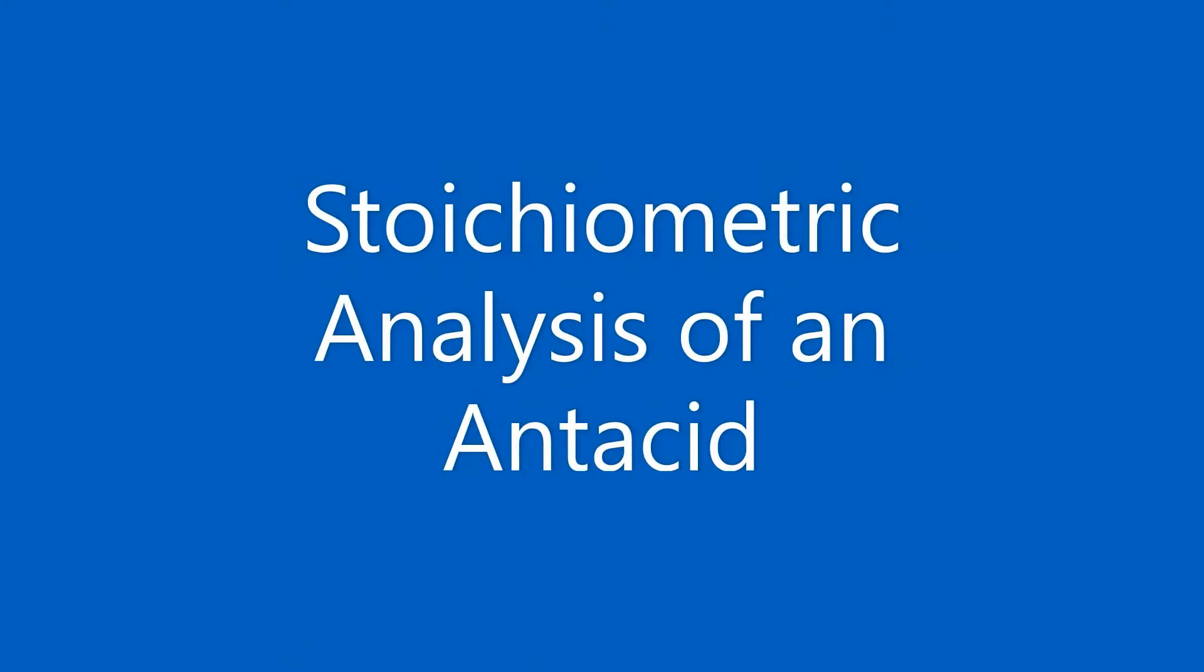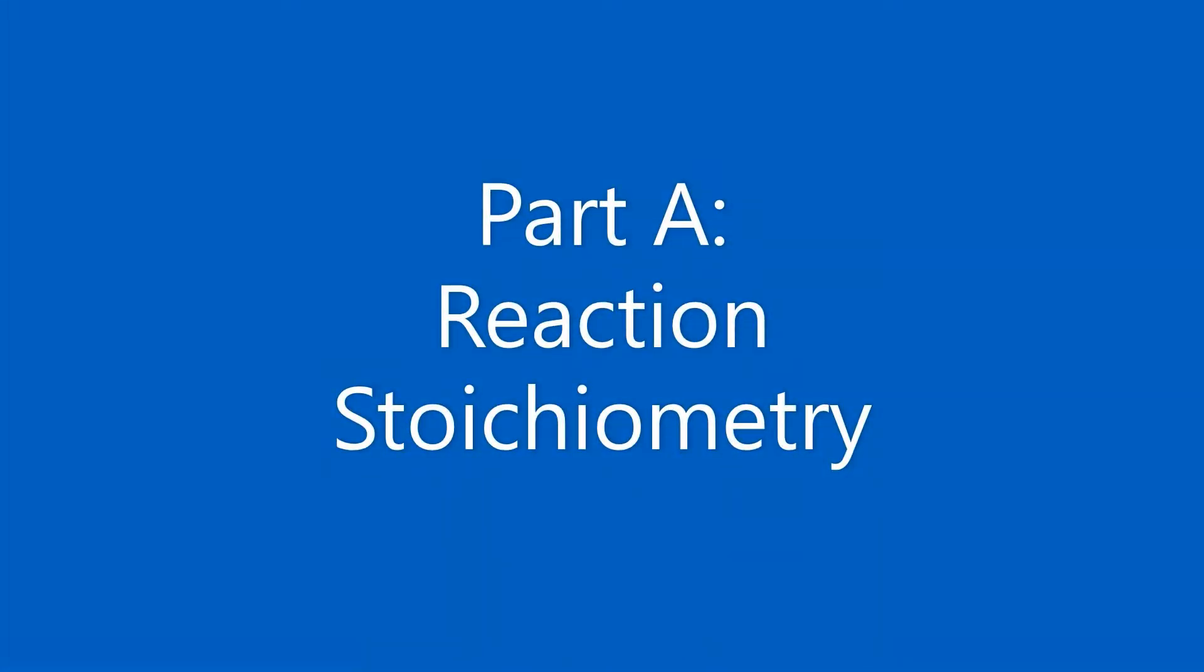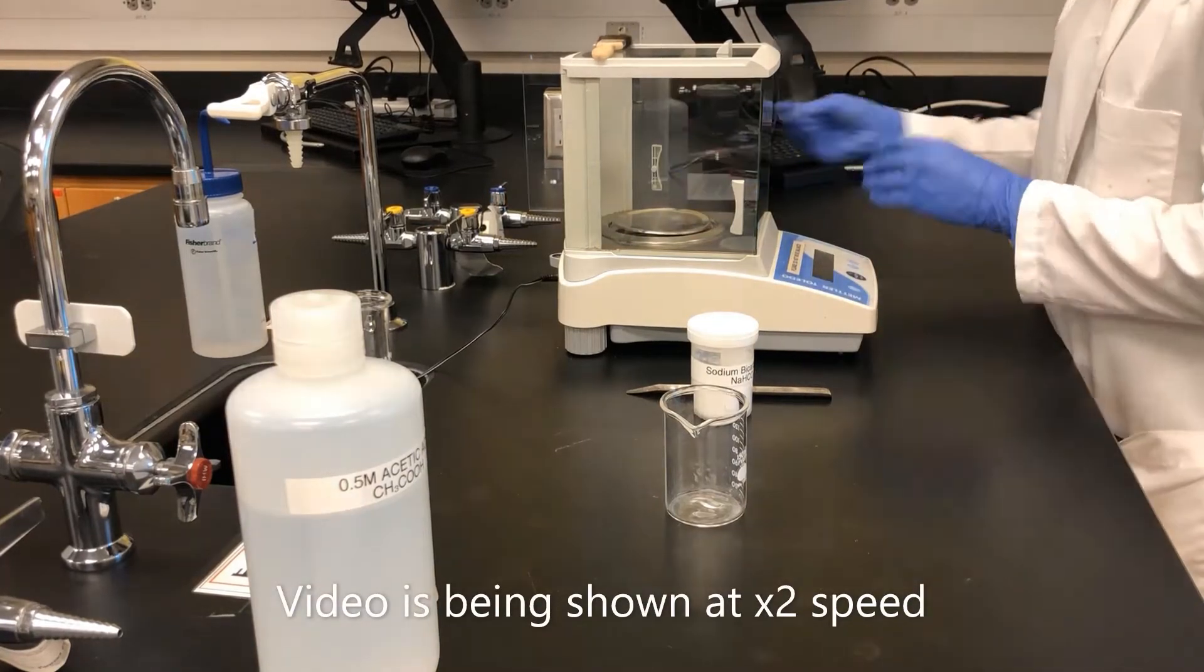Welcome to the stoichiometric analysis of an antacid lab. This is Part A, Reaction Stoichiometry. This video is being shown at 2 times speed.